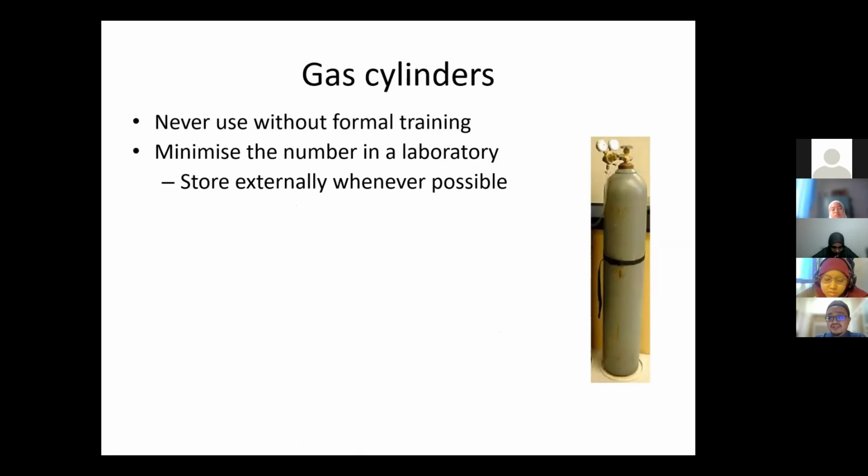They need to be stored externally, keluar daripada lab tu. Macam dinding. So kalau boleh kat luar, but make sure that kat luar tu dia taklah somewhere where usually there are people. Yeah, somewhere. Perhaps even in the cage.